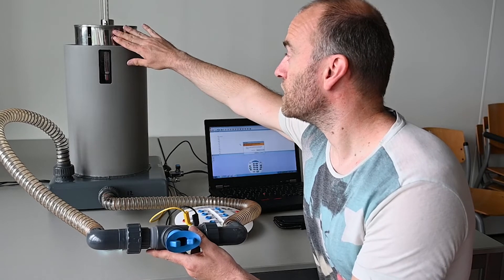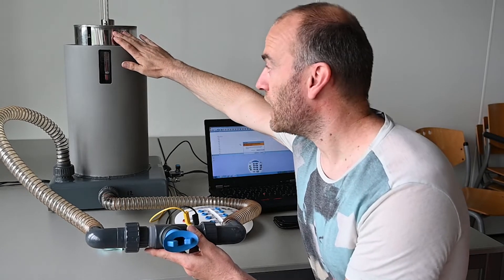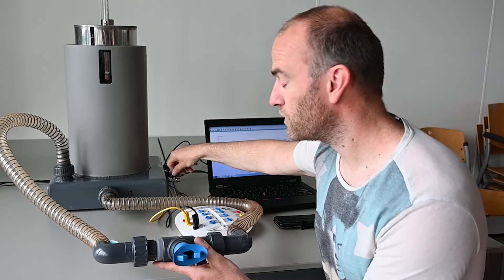Here you will have a container which is filled with air, and here you have a valve in which you can refresh the air after you have done an experiment.